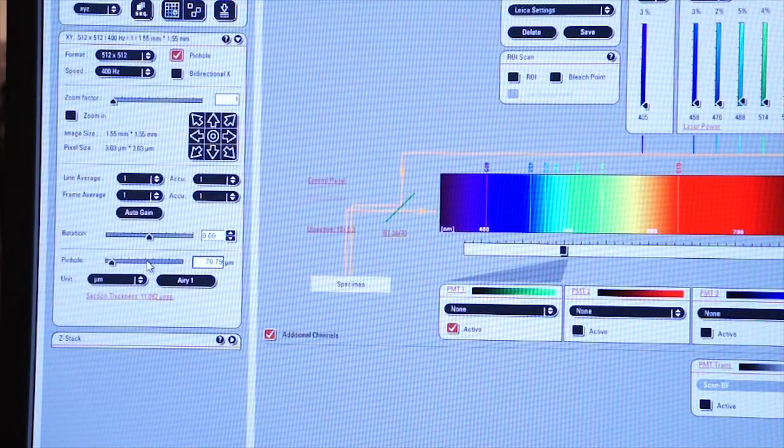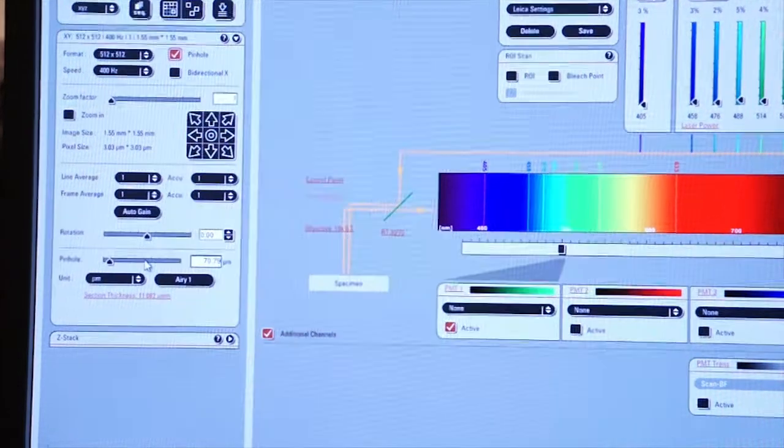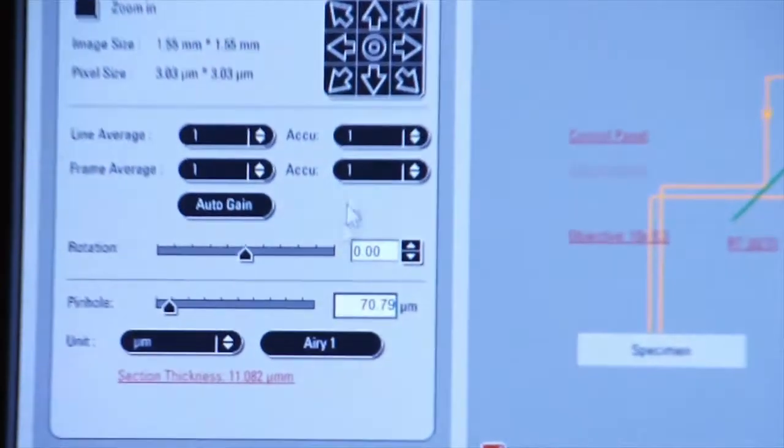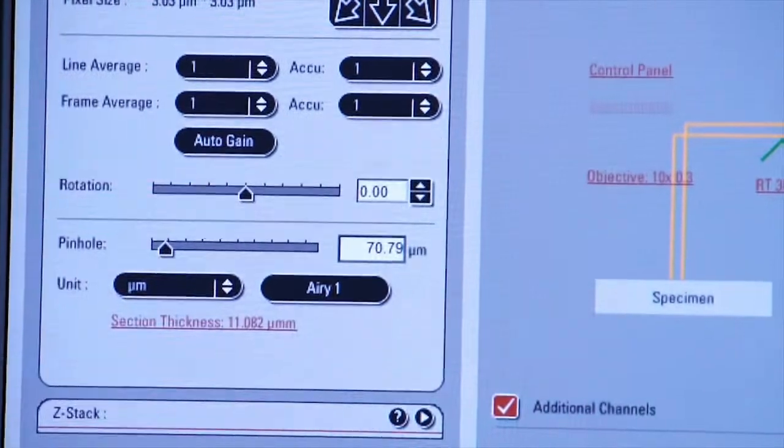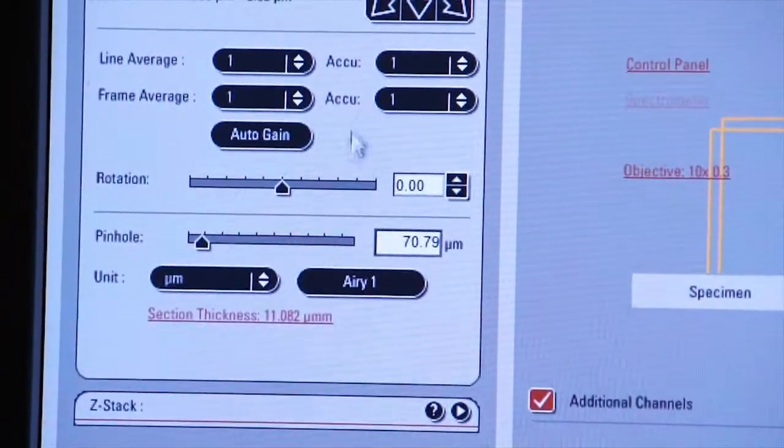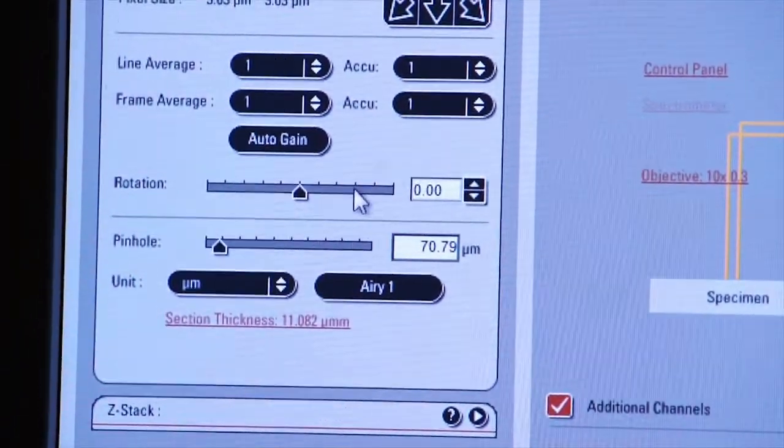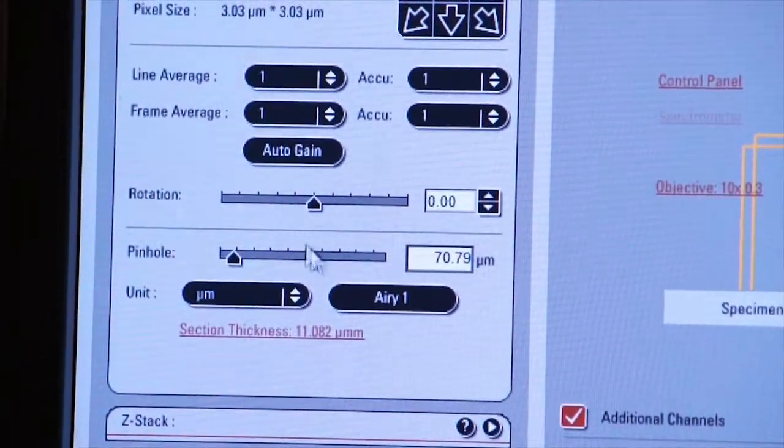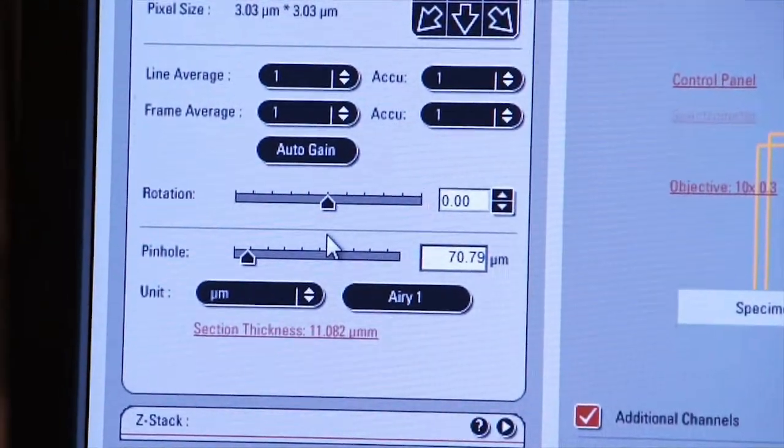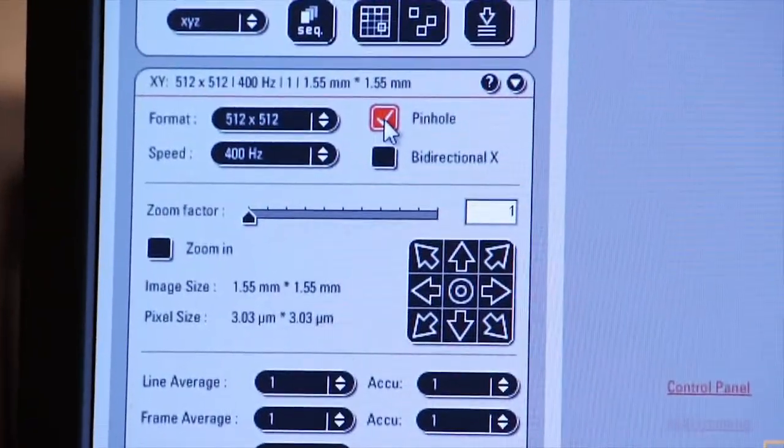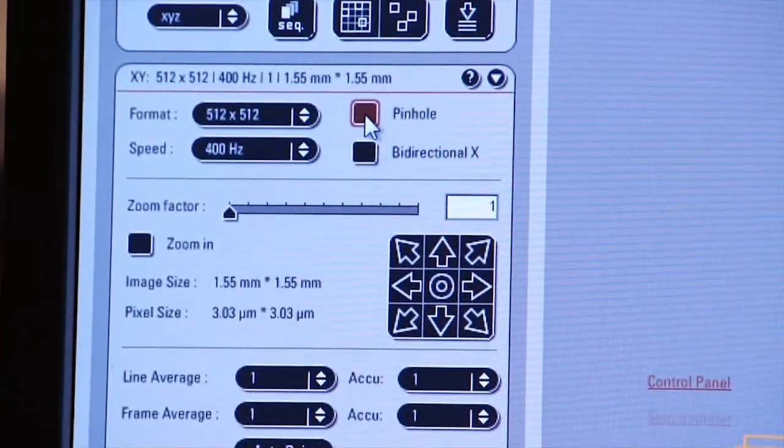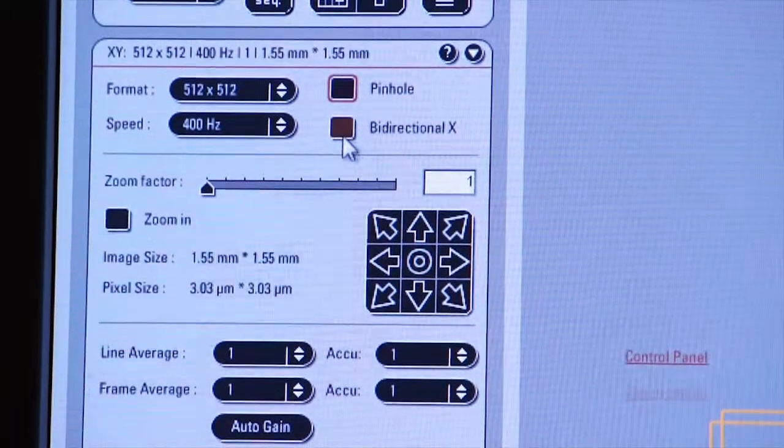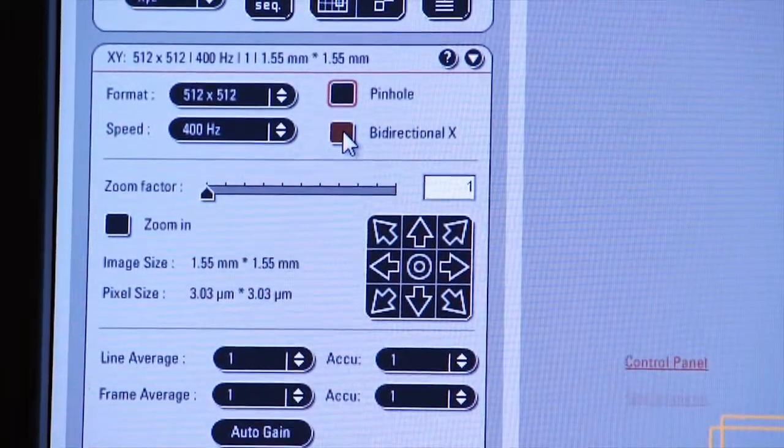Generally, the pinhole is set by the software, but as you see, you can click on pinhole, and then it will allow you to change the size of the pinhole. We'll discuss more about this later. For now, let's leave it unchecked. The other box that you can check here is called bi-directional X.